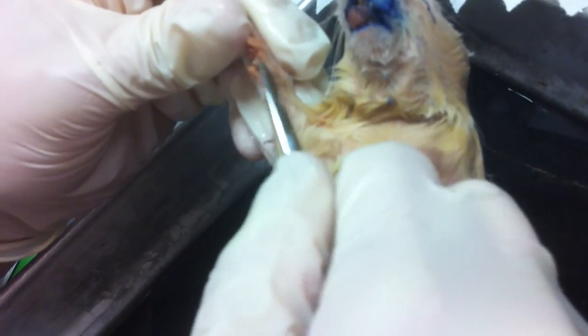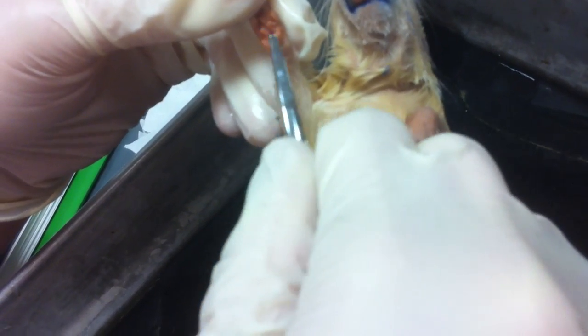Here's your thumb right here — this little stub — and then your horny pads. And then if we come down here we have the thigh and the hind limb.